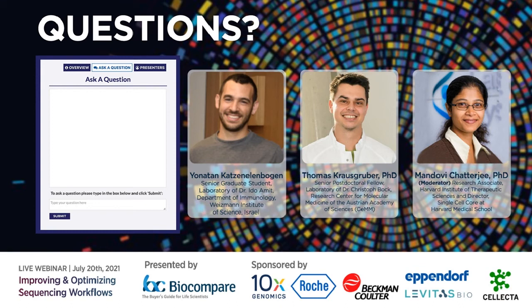Thomas, do you have any comment here? Yeah, similar to Jonathan, we also use in-house technology, but essentially what we mostly look at, for example, in bulk RNA-seq is just differential gene expression analysis, and I think there are plenty of softwares that can do that, or you can also find online, if you look at Git repositories, I'm sure you can find the relevant code to do this type of analysis.